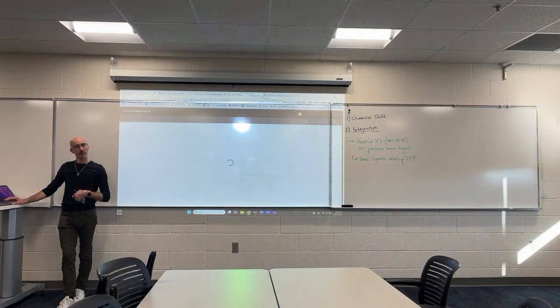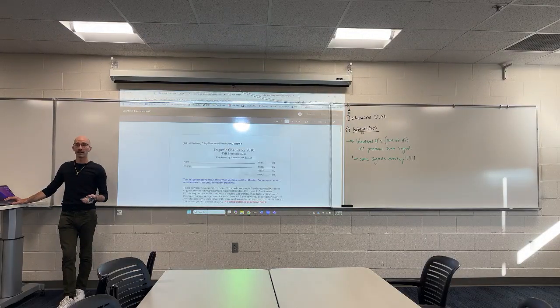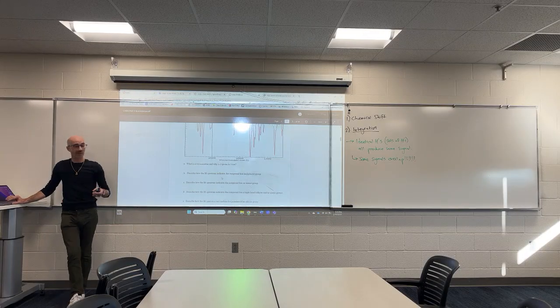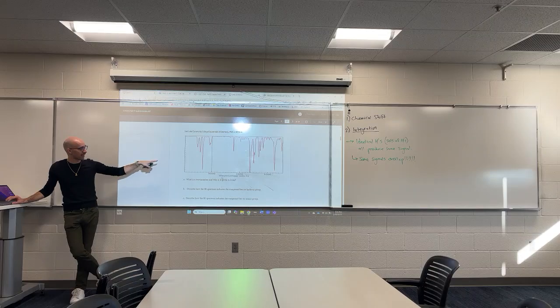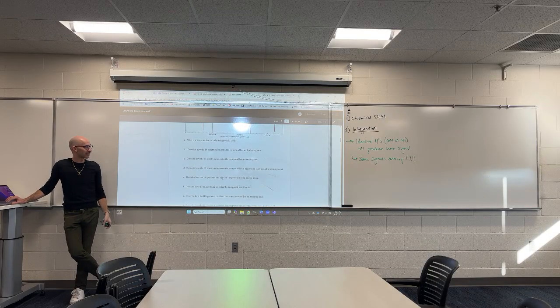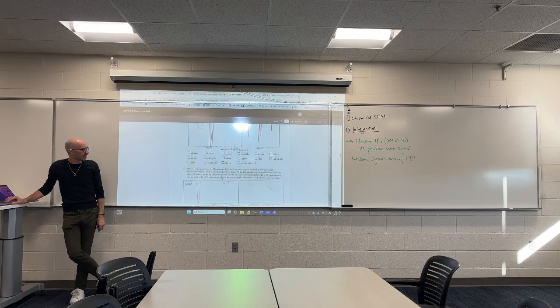But not my material, so it looks a lot different than what I will expect you to be able to do in this unit. For instance, this is a simulated spectrum, I believe, not necessarily an experimental spectrum. So it looks a lot different than the ones I'm going to show you most of the time because it's not a real spectrum. But here's a question.